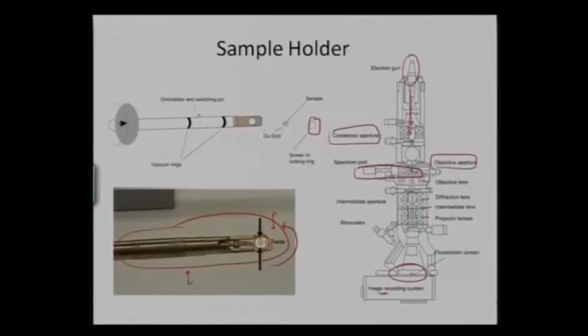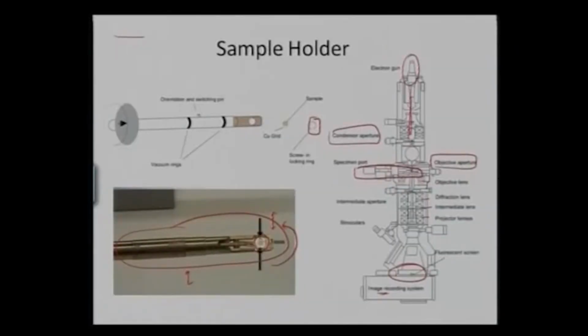So I might require samples from the surface as well as from the core to be able to say what is happening at the surface and what is happening inside the core of that particular rod. Since I want my sample to be representative of the bulk material, I will take many samples from the surface as well as from the core, because what I am seeing in TEM is only a very small regime of the overall bulk. So I need to very carefully select the region which is truly representative of my overall bulk material.